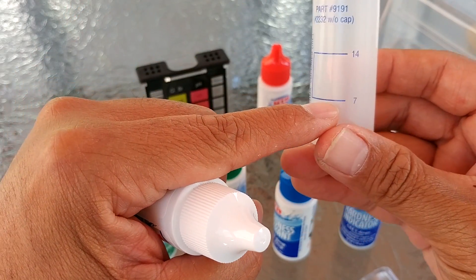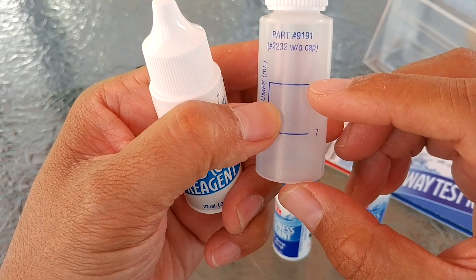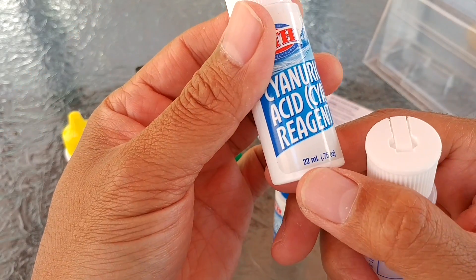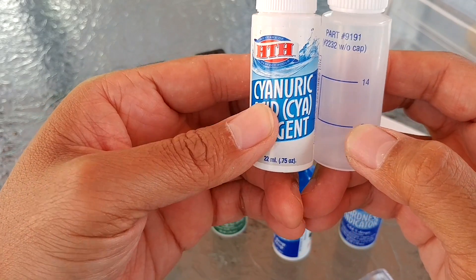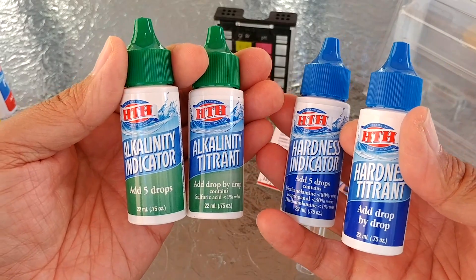For cyanuric acid, you need to fill the reagent up to the 7 ml line and then fill it up with your pool water. The bottle has 22 ml, so if you don't waste anything you should be able to do three tests of cyanuric acid.